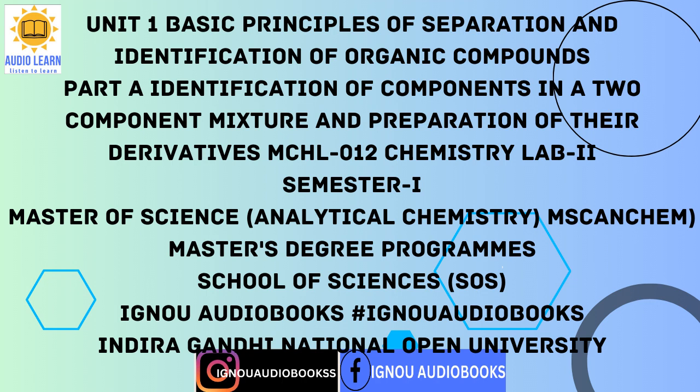2. Compounds containing nitrogen. Common nitrogen-containing compounds include nitro compounds, primary, secondary and tertiary amines, and amides, substituted amides also. Here, we will discuss the tests for each of these classes of compounds. A. Nitro compounds. The nitro compounds are usually yellowish in color and give different reduction products depending upon the reducing agent used. Thus, they act as oxidizing agents. The following tests can be used to check the presence of nitro group in a compound.